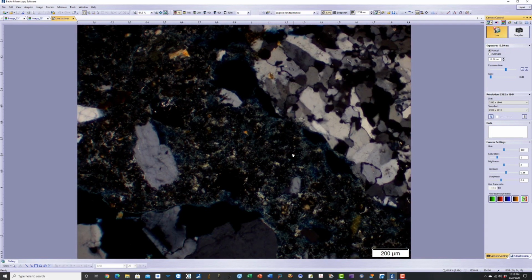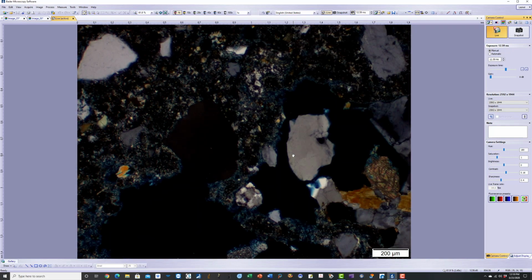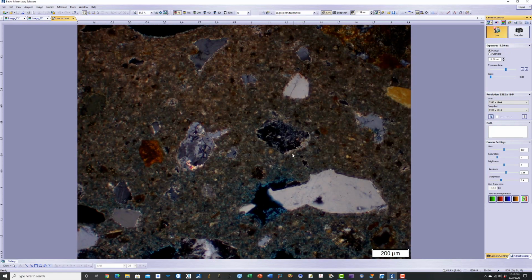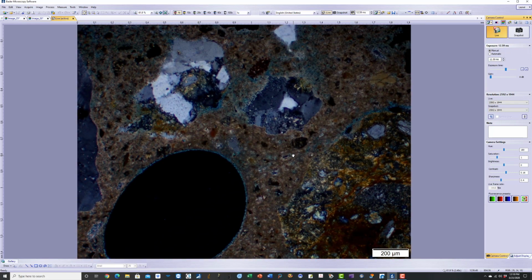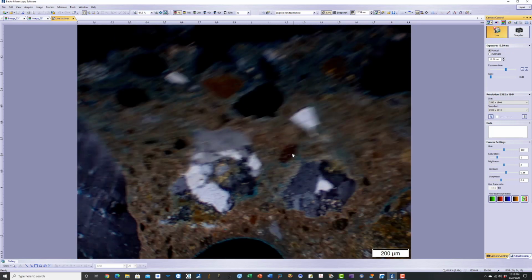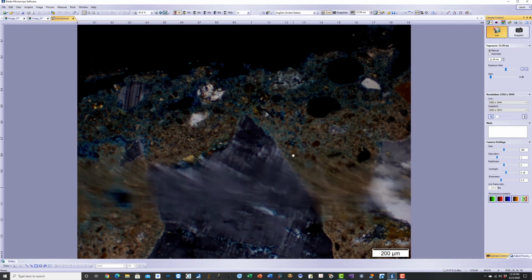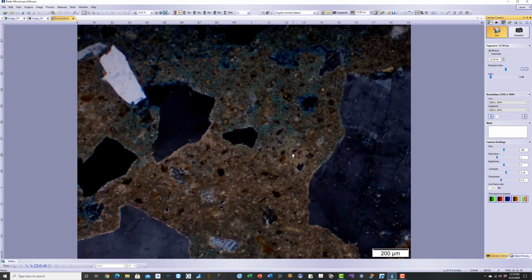So you have multiple layers of microstructure showing different events happened at the exposed surface region of the concrete before the protective mortar coating and the paint combinations were applied. So there was a period this concrete was exposed to atmospheric moisture and chloride and carbon dioxide, which has caused the spalling of concrete in the balcony slab before they decided to put this protective mortar coating and the paint combination.